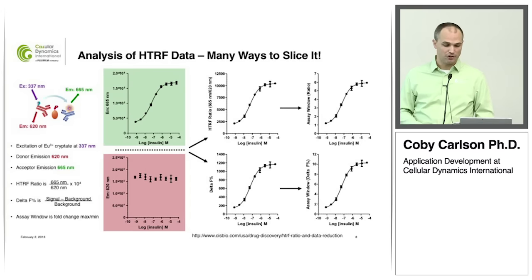It's a ratiometric HTRF assay. And there's a lot of different processing of the data after it's done, but there's an excitation wavelength, then you read 2 different wavelengths, and you take an acceptor emission and divide it by the donor emission to create what is called an HTRF ratio. And in some instances, you can multiply this by 10,000, and you see data looks like this. What you're seeing here is the plotted values of the acceptor emission. This is the donor emission, and it stays flat.